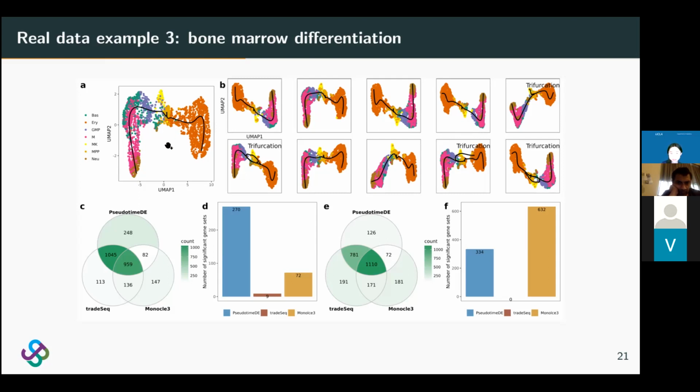But in our method, what we do is that we use a pseudotime inference method, and our method is flexible and adaptive too, so use whatever method. If the original data gave us a bifurcation trajectory, we only pick the subsamples that also gave us a bifurcation trajectory so that we can have the same topology between subsample and the original data to make our inference easier.